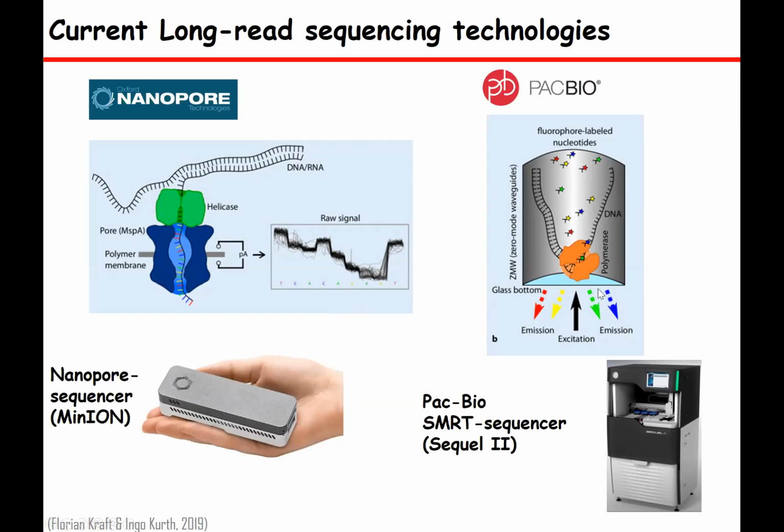Compared to nanopore, PacBio is a kind of size limiter. You cannot get longer reads in PacBio since it's sequencing by synthesis. However, with nanopore, it doesn't matter how big the DNA is, it can just go inside and produce. For example, recently, a more than 2 megabase single read sequence has been generated using nanopore, which is the highest by any sequencer.